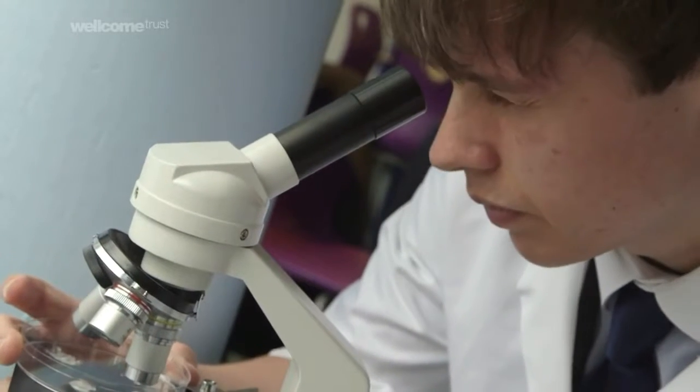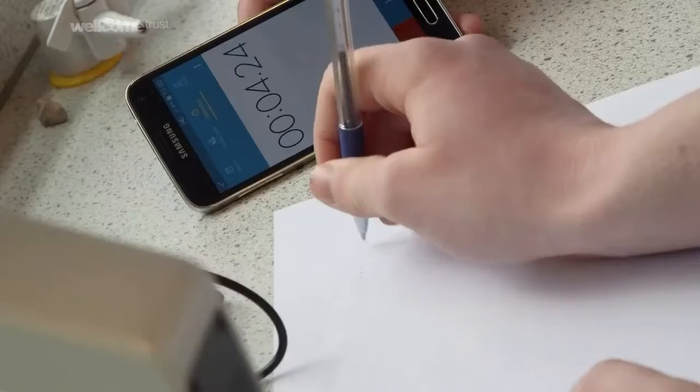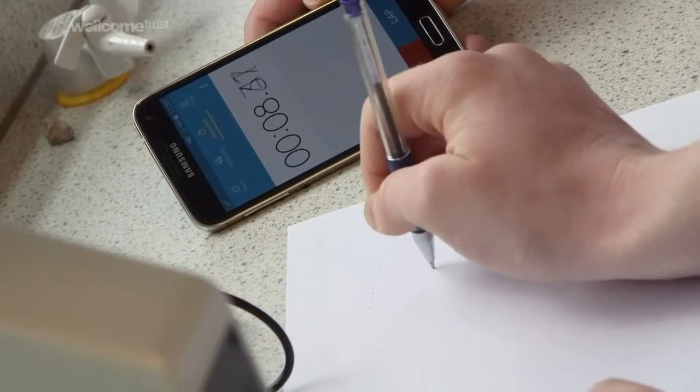And what we're looking for is their heart. Once we've identified their heart, we can record their heart rate. And then furthermore, we can subject them to different water conditions, different temperatures, and see what effect that has on their heart rate.